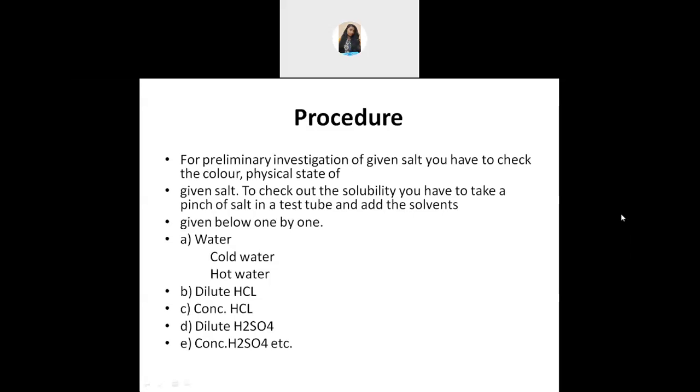Next you have to check the physical state of the given salt, whether the salt is crystalline or amorphous.